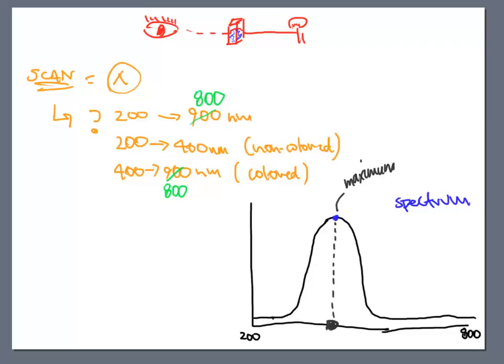So let's say that this is about 325. So what the machine will do is that it will list 325 on the computer screen, and it will put the nanometer beside of it, and it will probably put the word maxima over to the side of that as well.